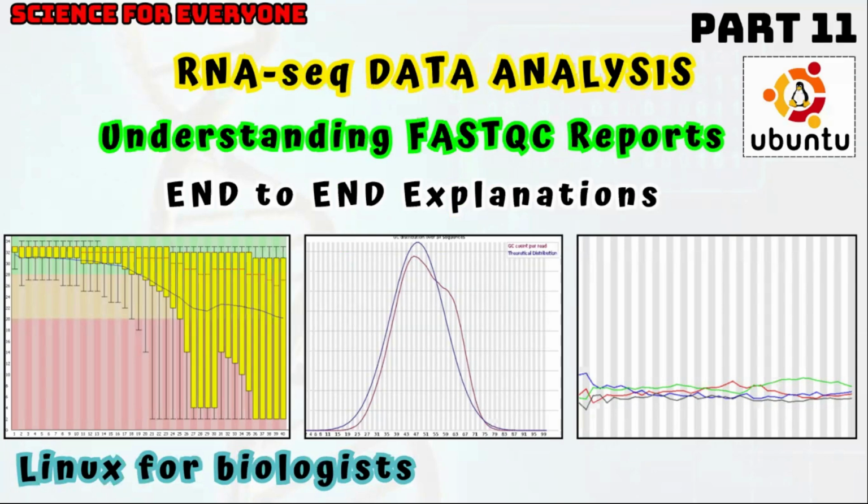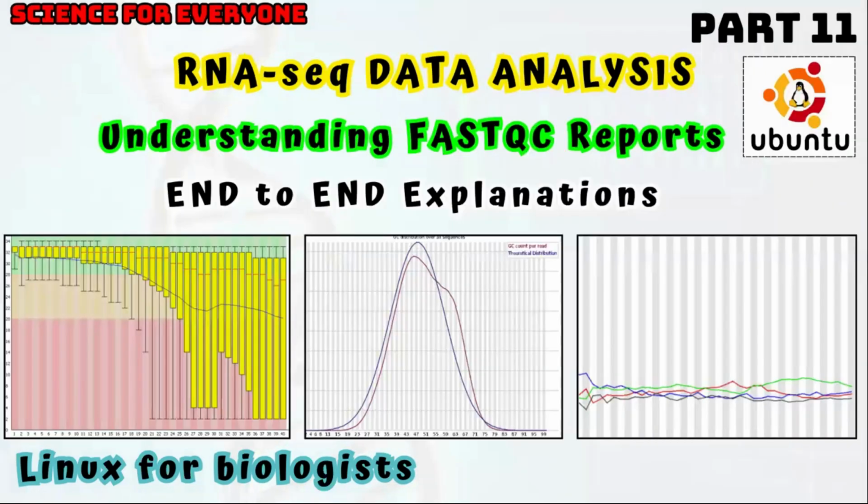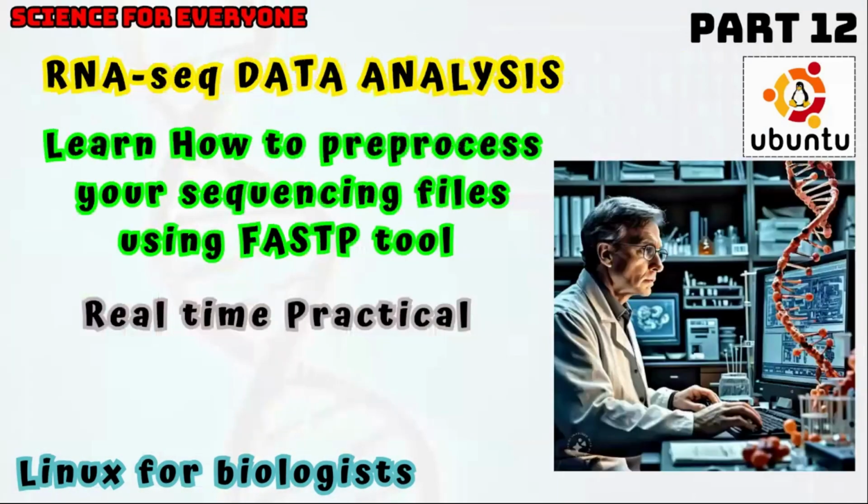So I recommend you watch part 11 of this video series. I have also talked about the quality of sequencing files in the previous videos, parts 4 and 5 of this video series, and I will share the link for it. I recommend that you understand the quality of sequencing files, then this video will be very easy for you, because I will not be explaining the quality of files. I will just be pre-processing it.